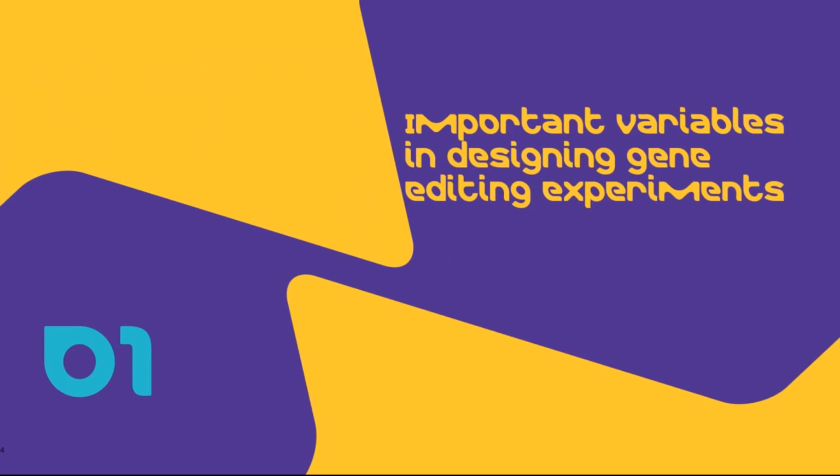Gene editing is a complex process. It involves many aspects of cell biology, and therefore success depends on many variables. Some of the variables are difficult for us to manipulate with our current knowledge, but some we can optimize in our experimental design to increase the chance of success.